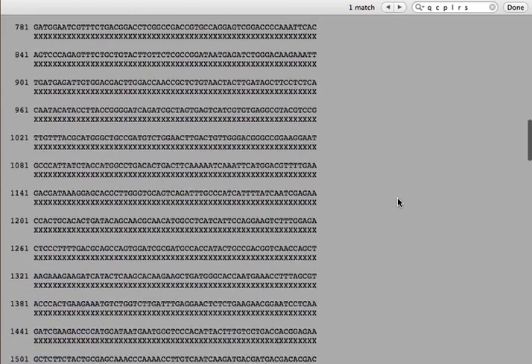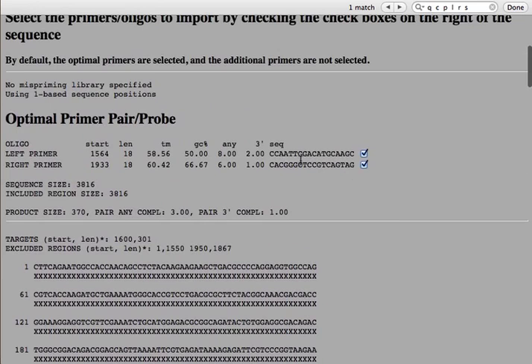Now let's go back up to our primers. And if we look at the 5' end of that particular primer, here it is. And it's not GTGCCC, as a matter of fact. It is CAC GGG, which is the complementary sequence to the one we have down there. So that's the other strand of DNA going backwards. So that requires a little bit of mental agility. You have to think about that for a second and realize that the sequence of the primer will bind to your DNA.